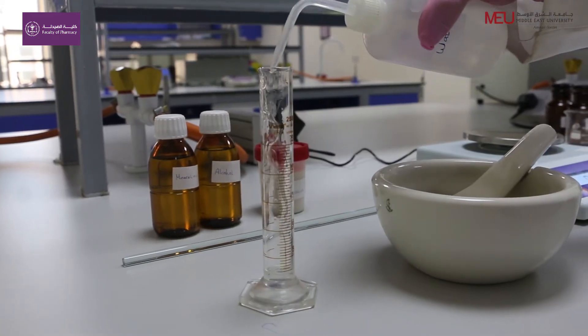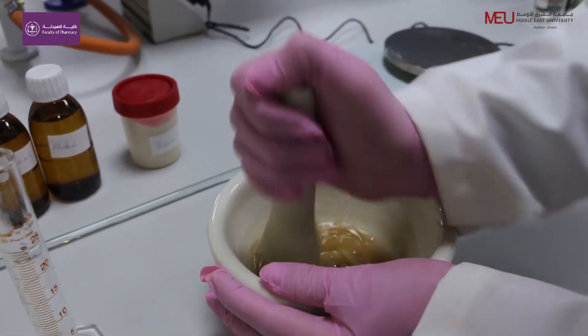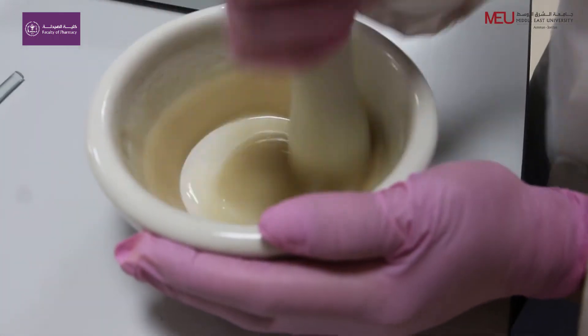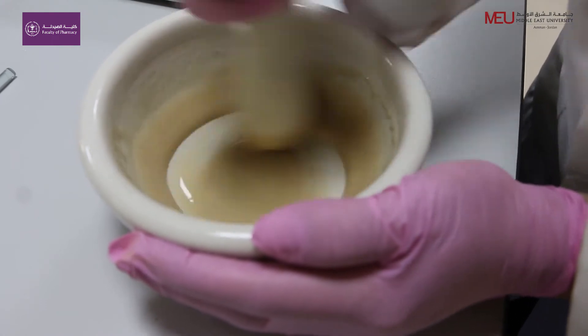Add 15 ml water all at once and mix continuously in one direction until the mixture thickens, then mix vigorously in one direction. When the primary emulsion is formed, you will hear a cracking sound and a white emulsion will be produced.